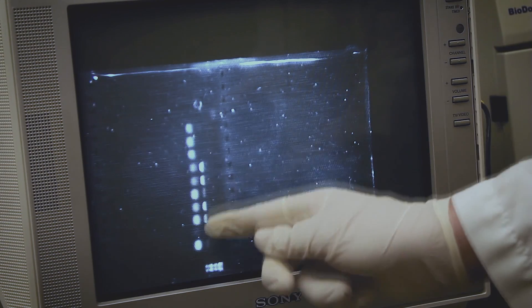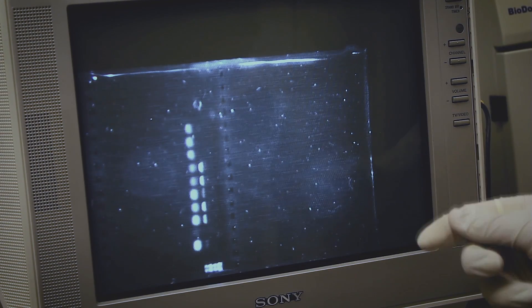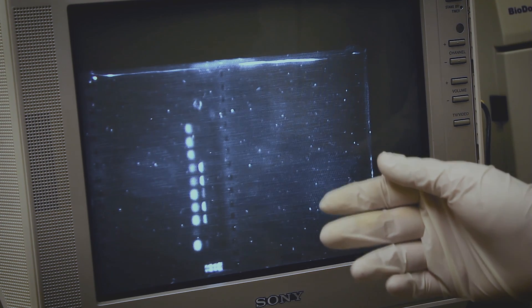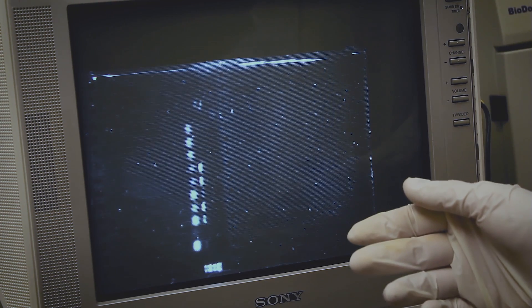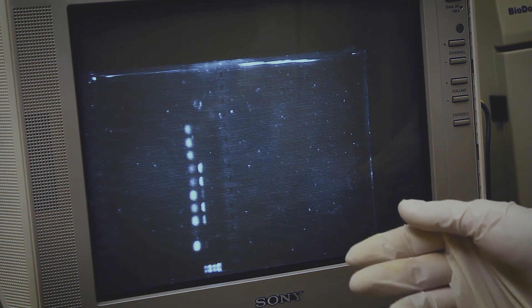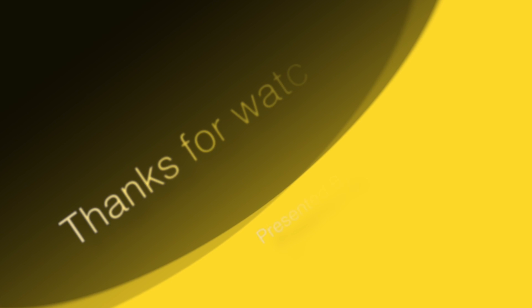These extra bands are primer dimers. The primers have amplified instead of the target DNA. It is not a huge problem unless all you see is the primer dimer bands.